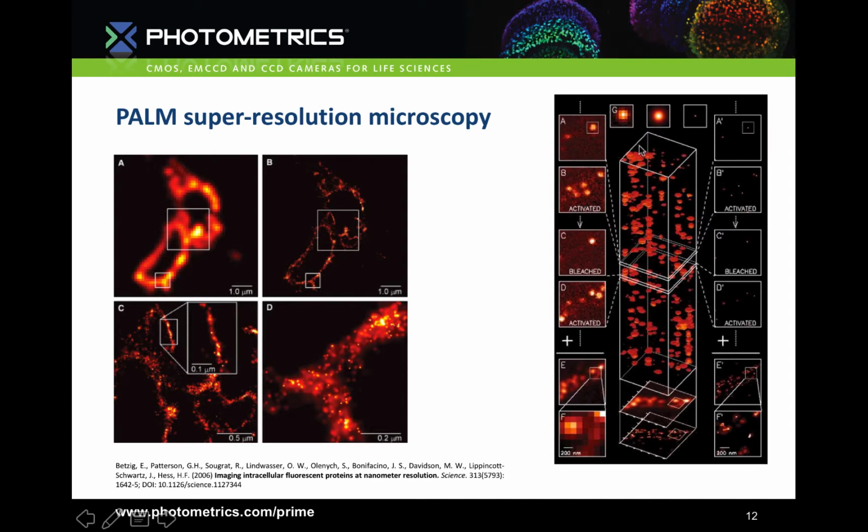So firstly, a laser of appropriate wavelength for the fluorophore is used to photoactivate a sparse subset of photoactivatable fluorescent proteins, with the number of fluorophores activated being controlled by using a sufficiently weak laser intensity. The fluorescent proteins are activated stochastically, but the probability of activation is proportional to the intensity of the activation laser.